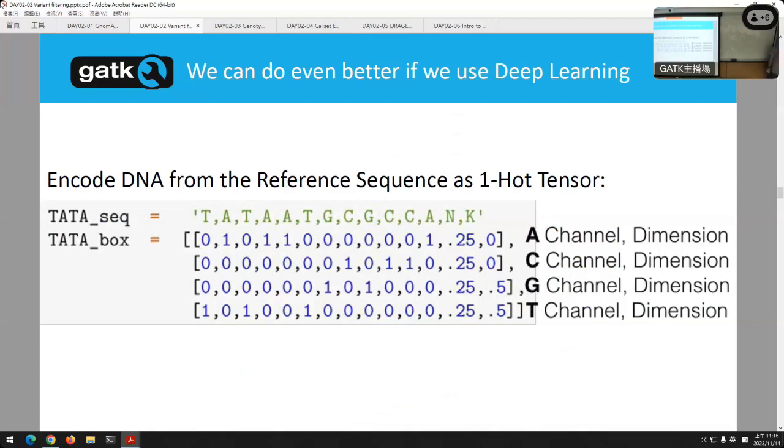You code Ns for "I don't know the answer." So there's a lot of inconsistency and unknowingness you can encode in this.